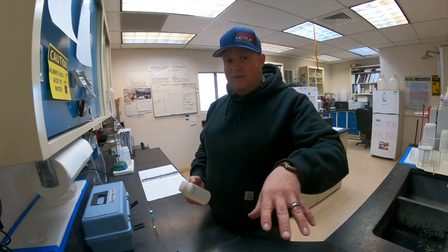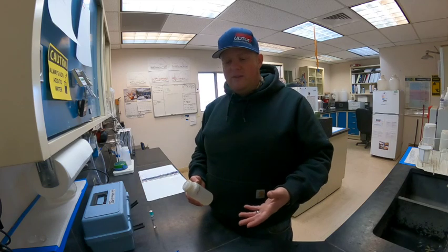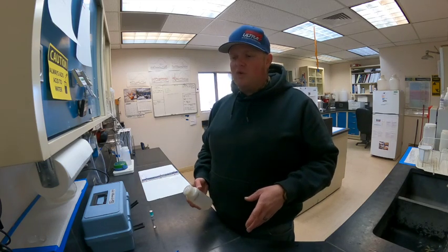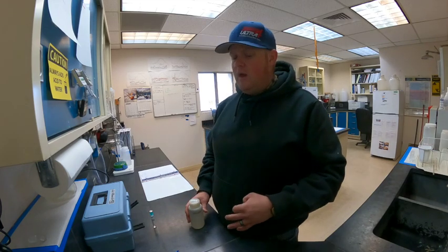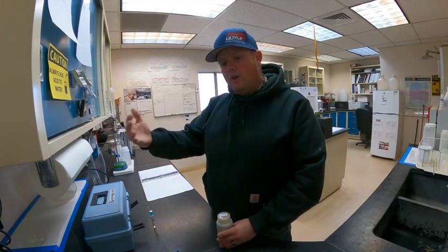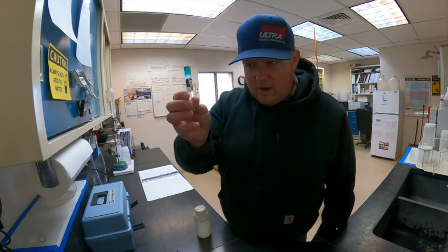Next, we're gonna run ammonia. Mind you, these are not compliance numbers I'm running. These are quick process control numbers. When we do a compliance day in the lab, do compliance ammonia, all that stuff, there's quite a bit more quality control methods put into place. What I'm doing right now is just a quick window into what's happening in my process. So we use Hach TNT reagent vials.